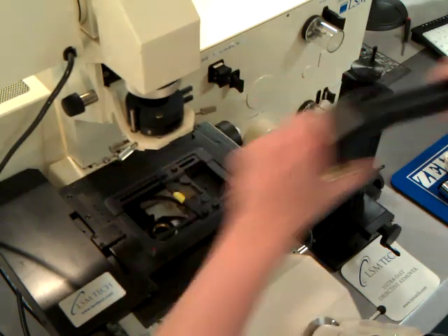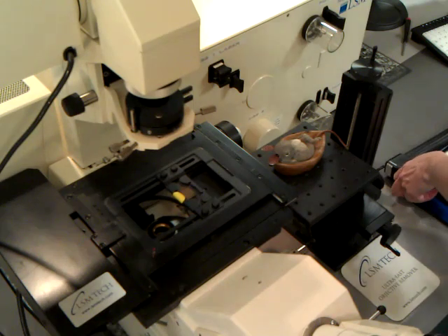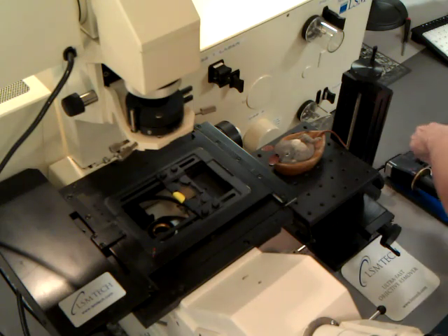The objective inverter performs excellently with any infinity corrected microscope, including either inverted or upright microscopes.